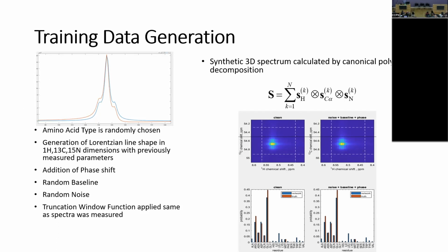On the right here, you can see an example of this. We have an example of the synthetic image for a signal, which was the input to a neural network. At the bottom, in blue, you can see the predictions from the neural network, and the reds were the actual correct values of the 5 parameters which were used to generate this image.